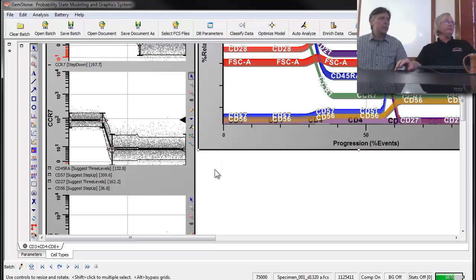If the program is suggesting a certain profile, a step down in this case, it also knows where to position those two steps, and how to initially set up the line spread for them. There's a lot of information behind that recommendation.